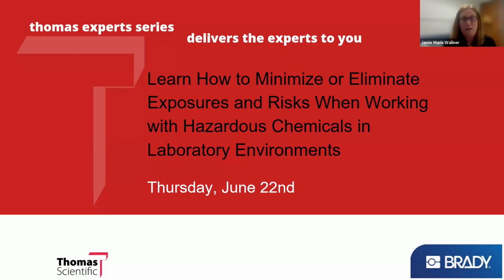that will tell them how to protect themselves when working with chemicals, what to do if they're exposed to a chemical, how to store the chemicals, etc. It's going to be that guide for your employees on how and when to use PPE, engineering controls. It's going to tell them which materials require a controlled environment. It's going to guide your employees on how to bring in new chemicals.